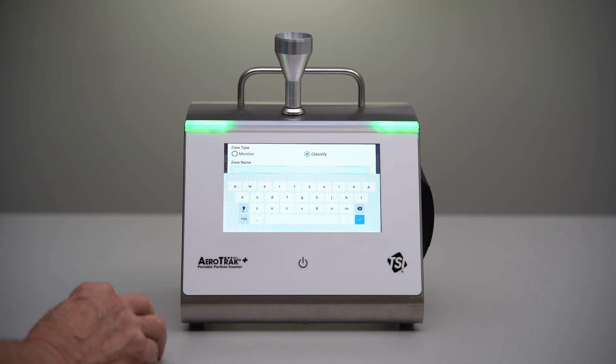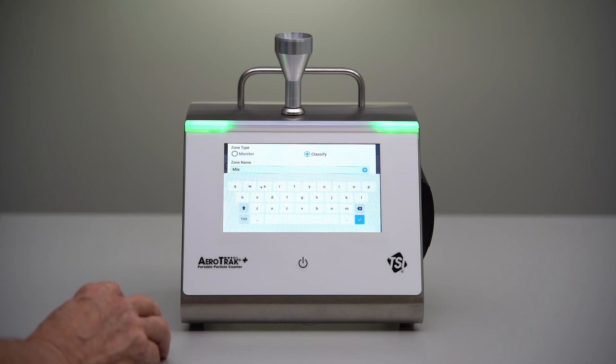We can name this anything we want to. I'll just name this zone Mike. Of course, you would name it your clean room name and number probably if you're going to certify a clean room.